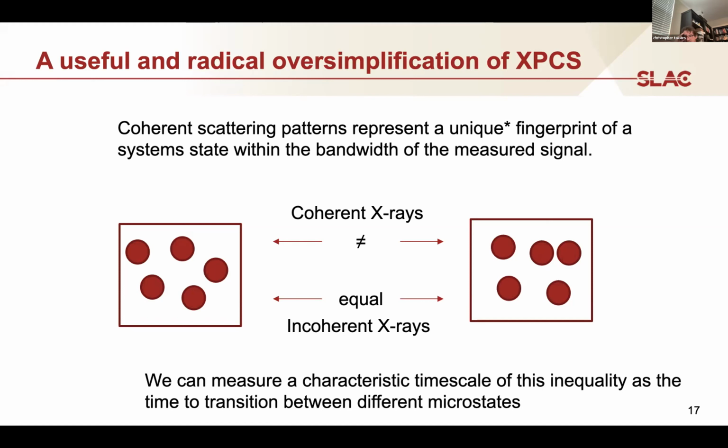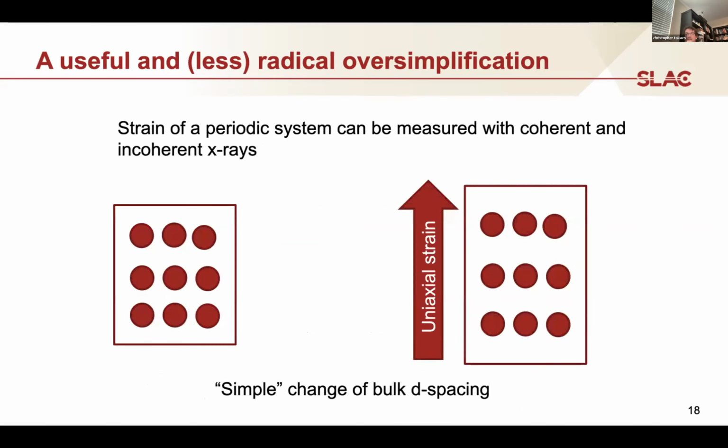And the way I always like to say it, although it makes Hans, my old collaborator, cringe, is that every speckle is an independent reporter of the state. So if you have 1 million pixels, you have a lot of sensitivity for looking for small structural transitions. The other one was really pioneered by, oh wow, I'm blanking on the name. It's on the next 2 slides, but it's looking at strain. Mark Sutton, yes, thank you. I feel a little embarrassed about that. A lot of this work is based off Mark's work.